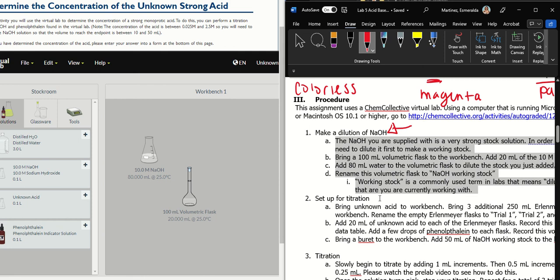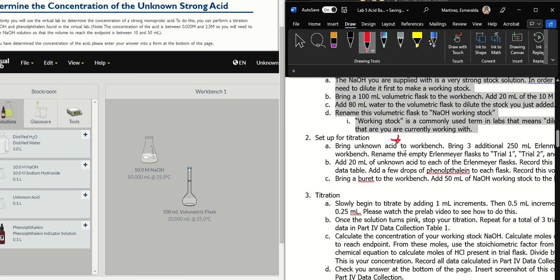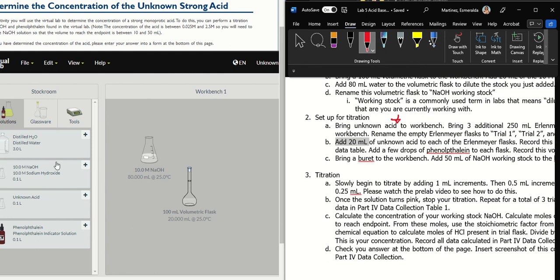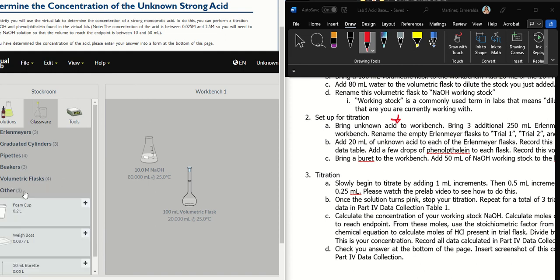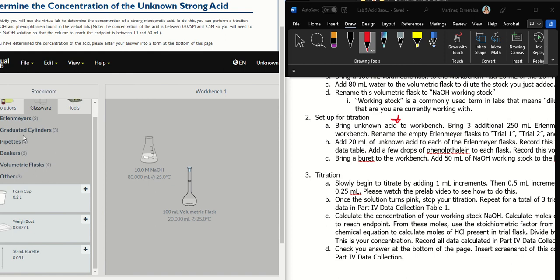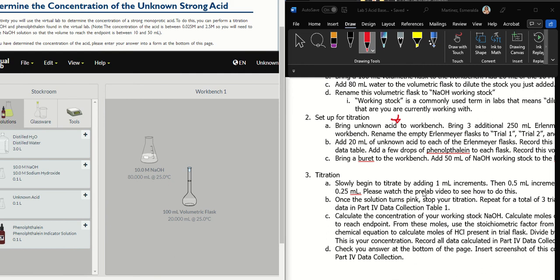Then, you're going to set up for titration. So you are going to bring your unknown acid to the workbench. It's right here. Everything's labeled pretty much the same way I describe it. So hopefully there's no confusion there. But you are going to do a few trials. And for each of these trials, you are going to start off with 20 ml of your unknown acid. Okay, that's important for later. Don't forget to add your phenolphthalein. It's right here, your indicator. That will happen to you. What I was describing earlier. What can happen to people in the lab. This will also happen here. It will not change color if you don't add phenolphthalein. And then you are going to bring a burette to the workbench as well. So I think the burette, yeah, it's in other, because it doesn't fall in one of these categories. But you're going to bring that here as well. And I'll let you have fun with that.